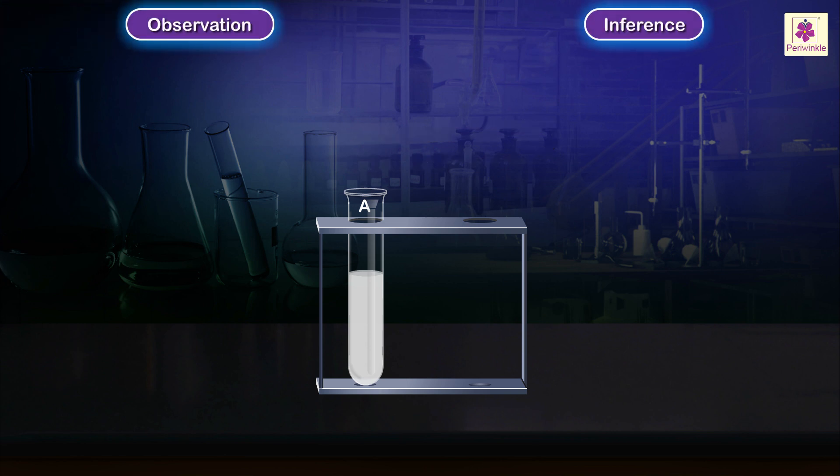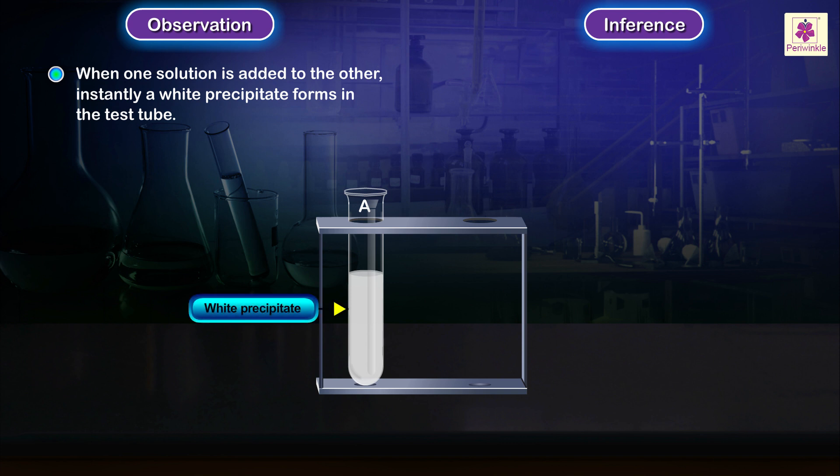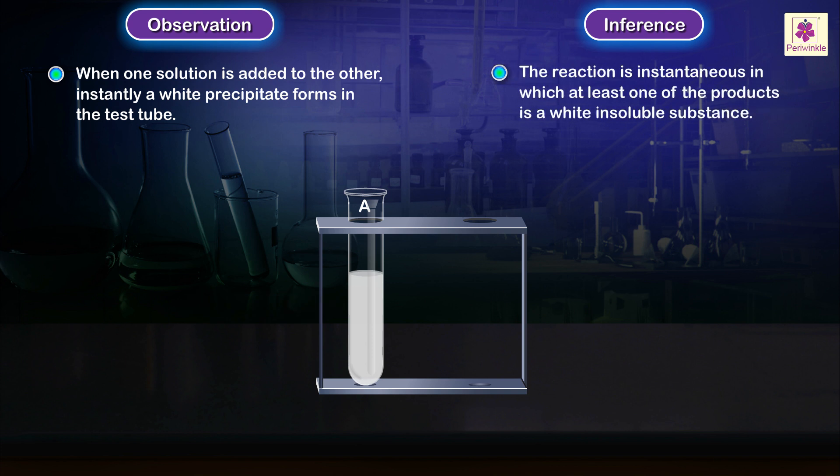Observation and inference: When one solution is added to the other, instantly a white precipitate forms in the test tube. The reaction is instantaneous in which at least one of the products is a white insoluble substance.